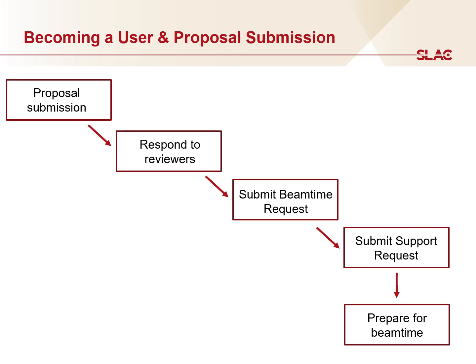A side note here is that generally, XAS and XRF users are on site for the duration of their beam time. Users are taught how to load samples and operate the beamline when their experiment time begins. During the pandemic, we are operating with remote access operations, and so aspects of scheduling, mailing samples, and requesting remote access to the beamlines may differ. If you wish to submit a GUP for the May 1st deadline, please reach out to us to discuss how the different beamlines are operating within the sample mail-in and remote user operations.